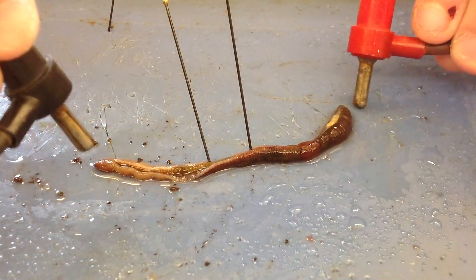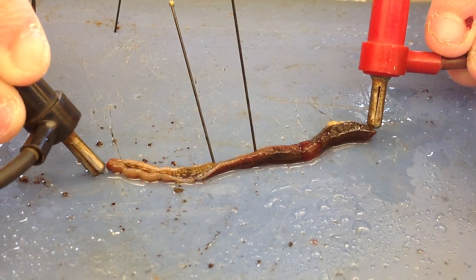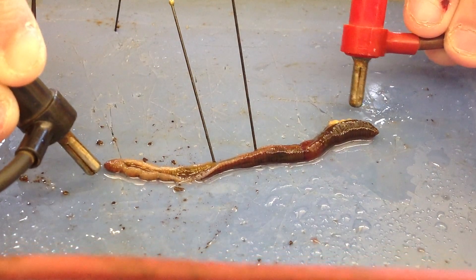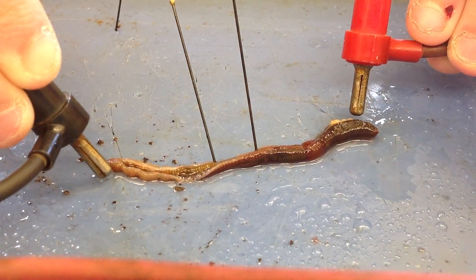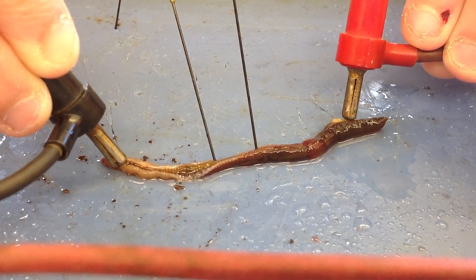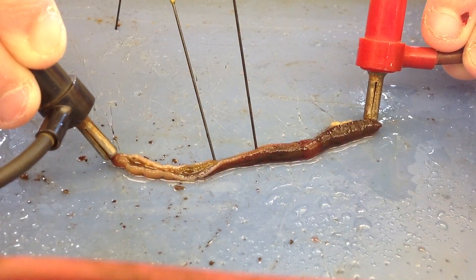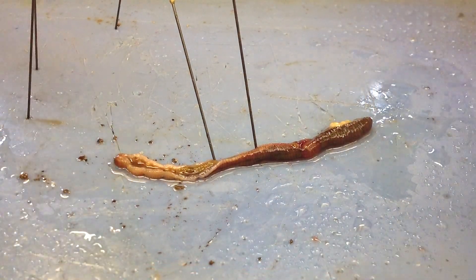Touch it to the worm again. Both ends to the worm. It's trying to move away from... There you go. There you go. And that's enough worm torture.